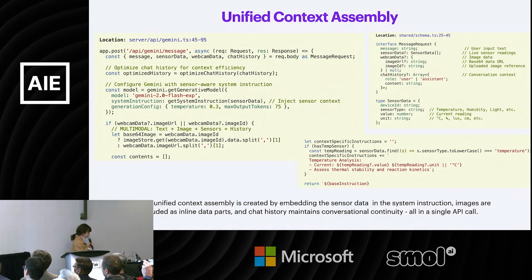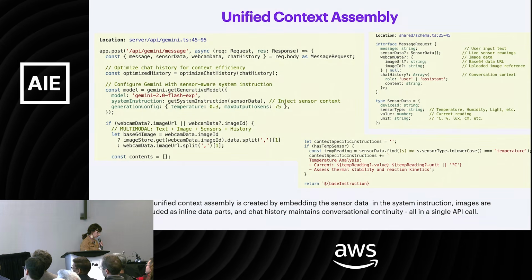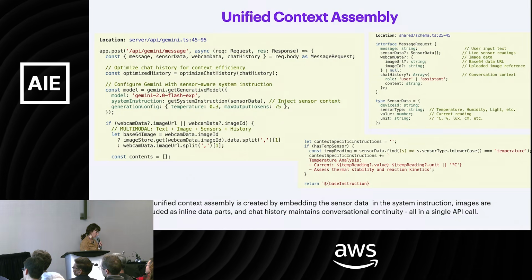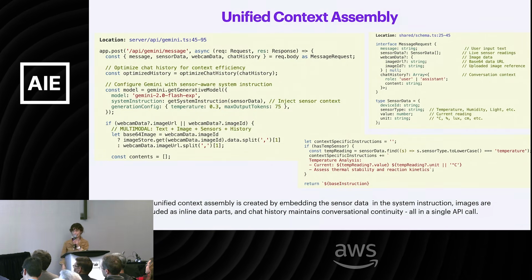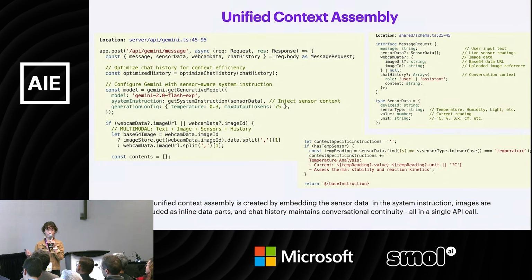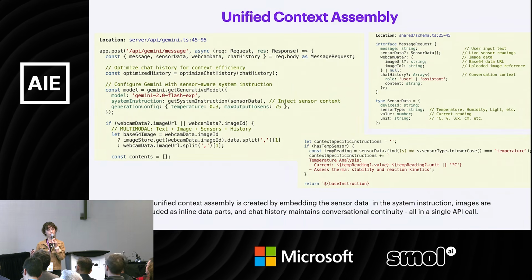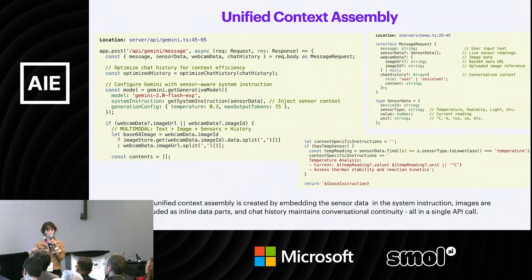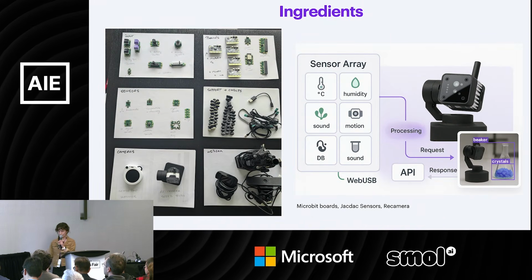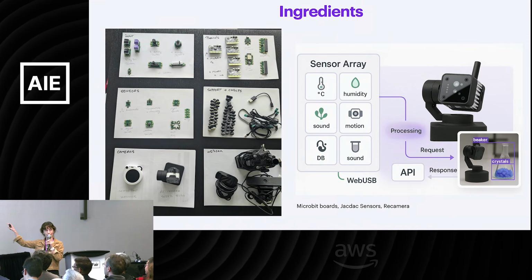So I guess the very important piece here is how you're doing this context injection depending on what sensors you have connected and the type of experiment you're defining, and making this dynamic on the fly, like when you create the protocols. Those were the ingredients for the code.